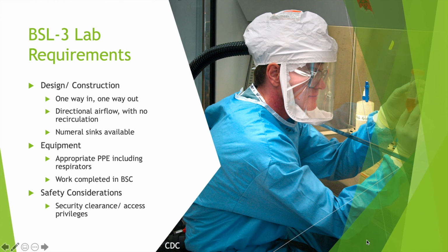Most biosafety lab agencies and facilities are required by law, actually, to keep a log of any incident and report or publish any instances of such. The general purpose of all precautionary measures in a biosafety lab is to protect not only the scientists in the facility, but also, probably most importantly, the public from infection.